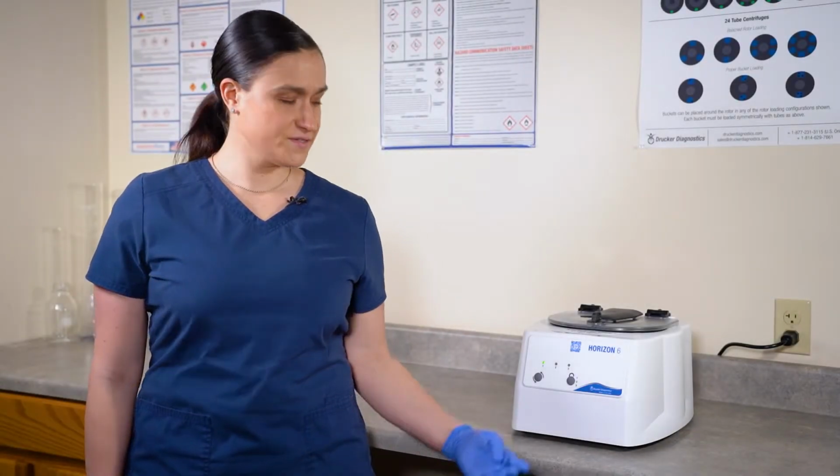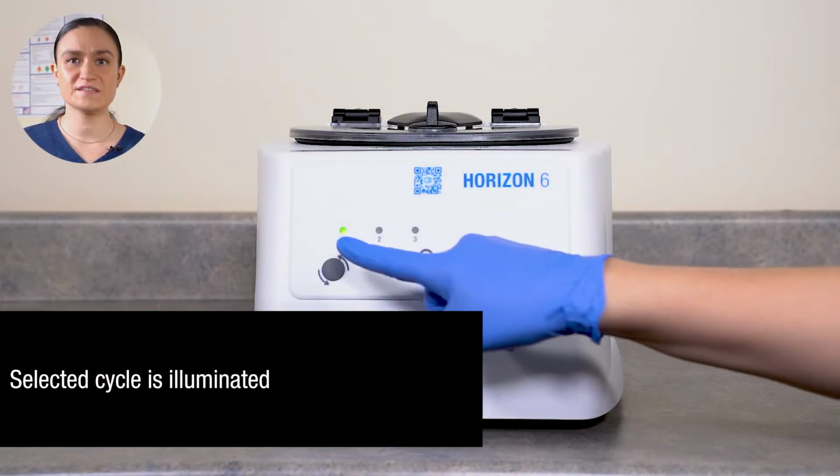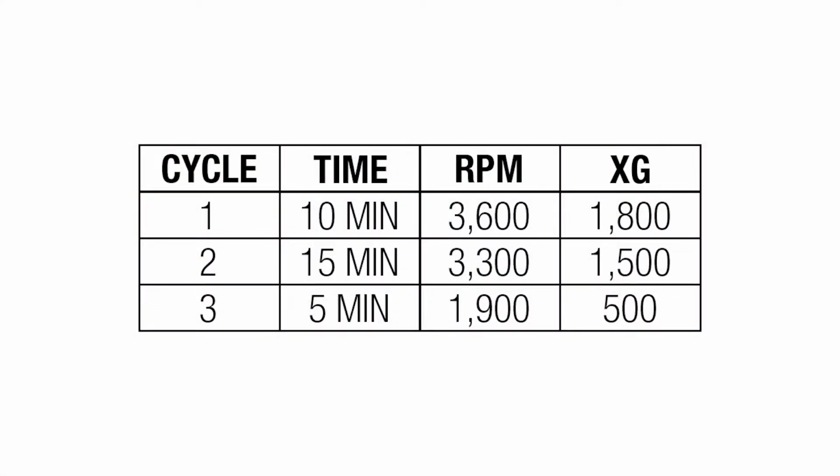Part 3, Controls Overview. Your Horizon 6 has all of its controls right here on the front panel. These 3 indicators show which of your cycles is currently selected. Your Horizon 6 spins 3 different cycles.